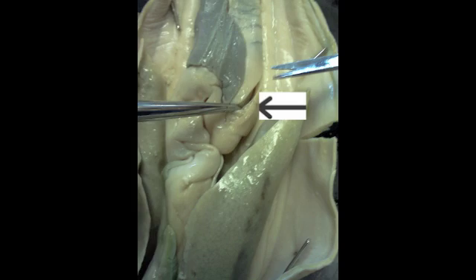This arrow is pointing to one lobe of the liver. The other lobe is on the other side. The liver is the largest organ in the body cavity. The liver produces bile, which digests lipids, and is rich in oil, which stores energy for the shark. In the pig, the gallbladder and liver do the same function. But in the pig, the liver is not as large as the shark's.